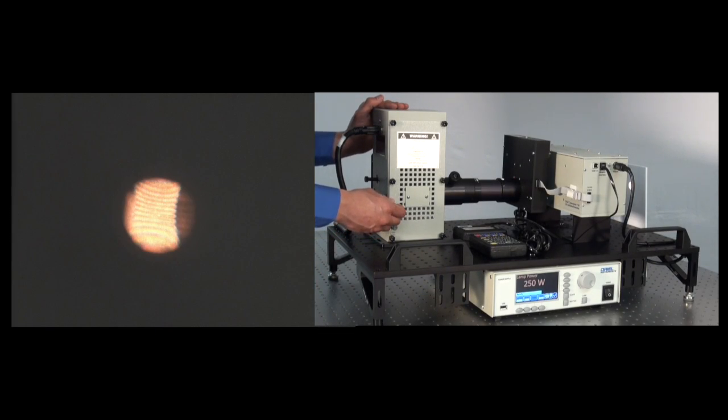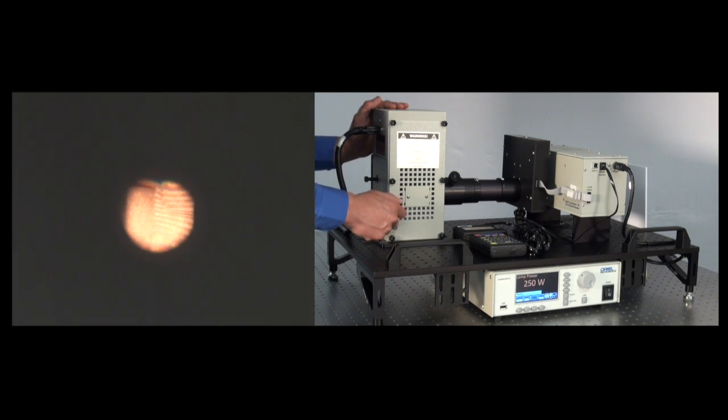we're going to center it onto the spot size output of the light source. So using these horizontal and vertical lamp adjustment knobs like we used before, we're just going to fix it. Just center that filament both horizontally and vertically into the spot size output of the light source.